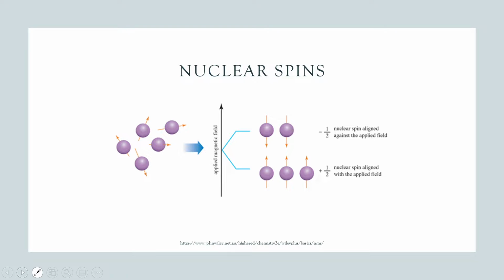It's a property of atoms and really delves into an area of physics and chemistry, or more specifically physical chemistry, which we don't need to know a lot about in detail. To explain how NMR works, I will need to refer to it though. So generally speaking, when we're talking about a nuclear spin, we're referring to the behavior of nuclei in an atom. And we do use this word spin. If you wish to visualize a spin literally as a round sphere spinning in one direction or the other, you're more than welcome to. I will say technically though, this is not the behavior that we are actually talking about when we refer to nuclear spin itself.